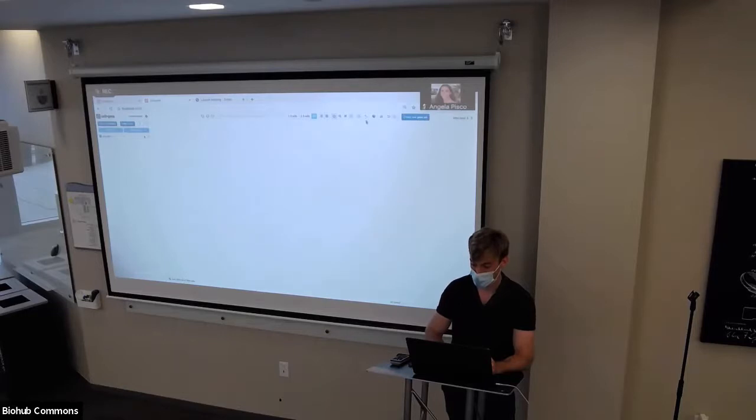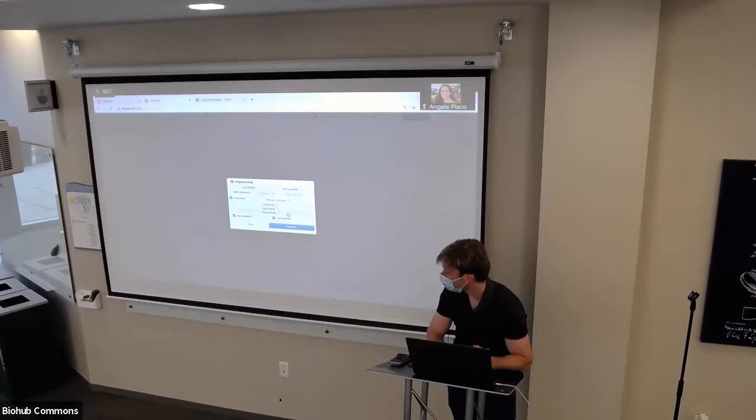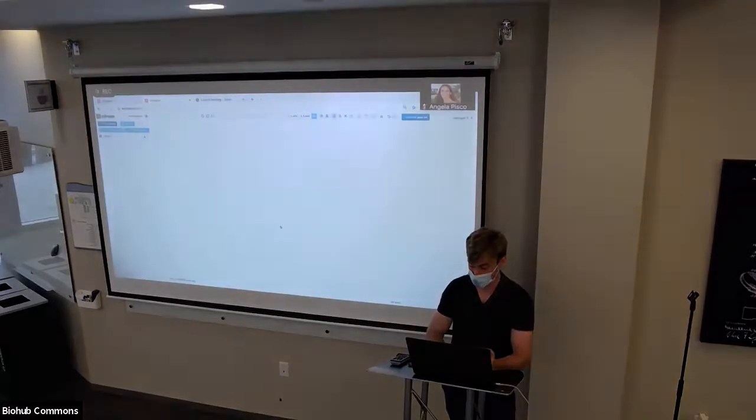This is kind of jumping the gun here, but we need to have something to look at to explore the native features of cell by gene. So what we want to do is click this button here. It says click to perform preprocessing. We'll check the preprocess button, and I'll go into much more detail about what these various knobs do later on. We're going to go to transformation, click sum normalize. This is going to make each cell have median library size. We're going to click log transform. Sorry, it's a little blurry, Sandy. This is going to log transform the data. Then we're going to hit preprocess. These spinners show up indicating that it's doing something on the Python backend, and preprocessing has completed.